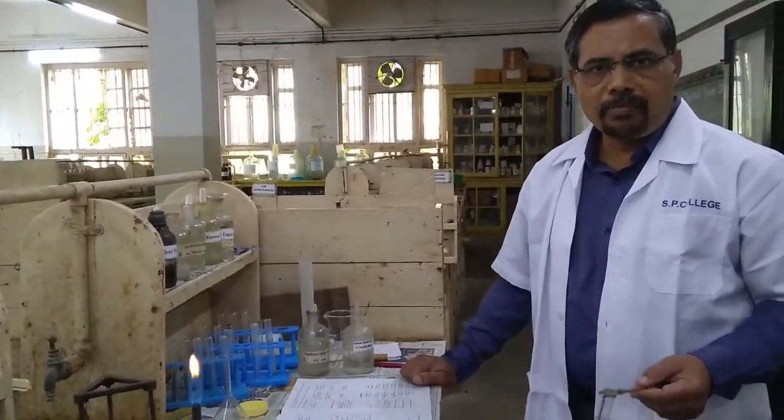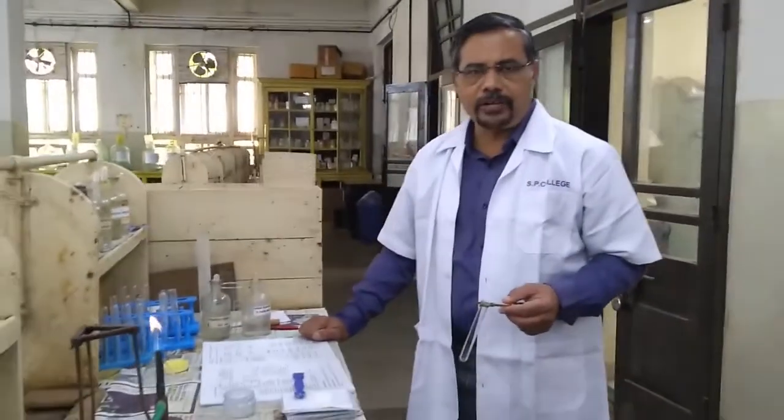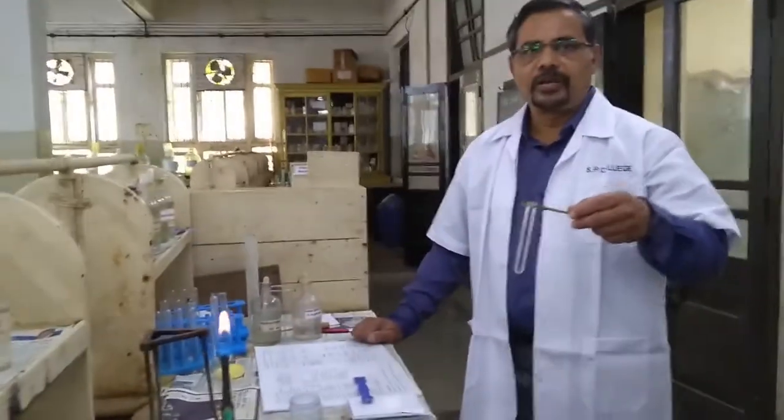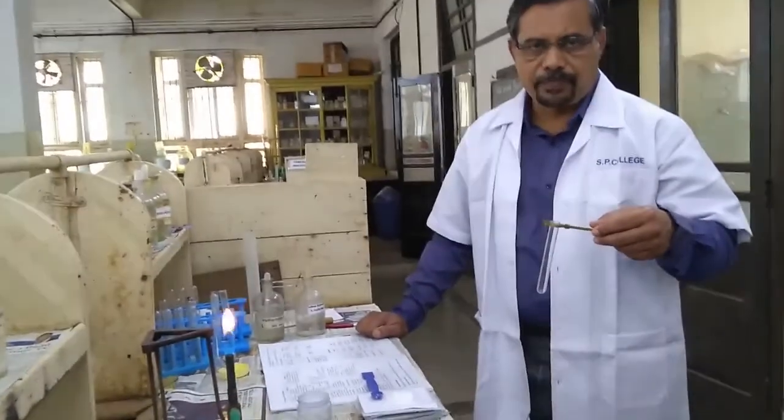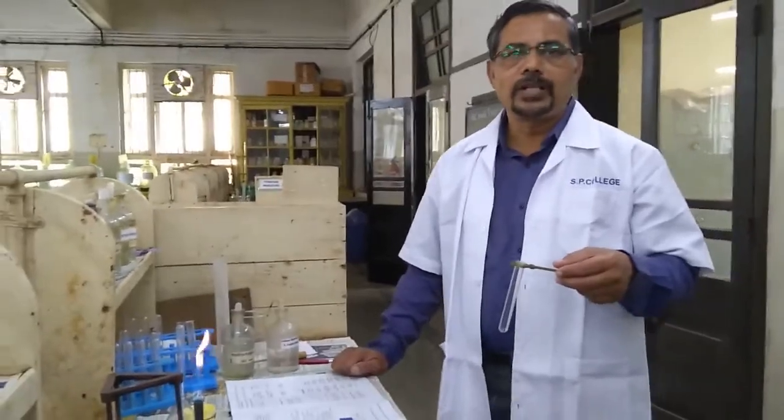So after completion of the dry test, we had studied action of heat and action of NaOH in the dry test step. Then the third step we had already studied, that is preparation of solution.